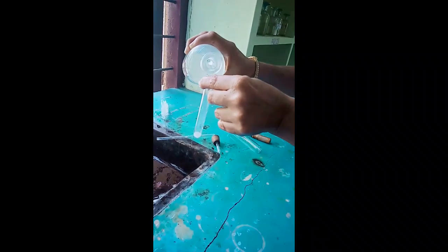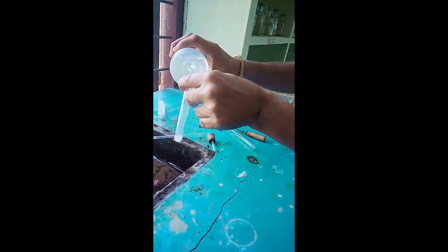So, test for silver nitrate: HCl gas turns colorless silver nitrate solution white. A white precipitate is formed on passing HCl through silver nitrate solution, and the white precipitate dissolves on adding excess ammonium hydroxide. So this is a test for hydrogen chloride. HCl on passing through silver nitrate solution produces a white precipitate, and the white precipitate is soluble in excess ammonium hydroxide.